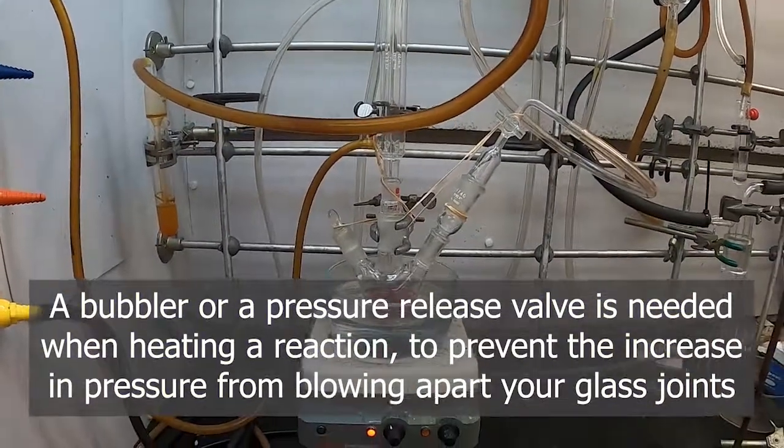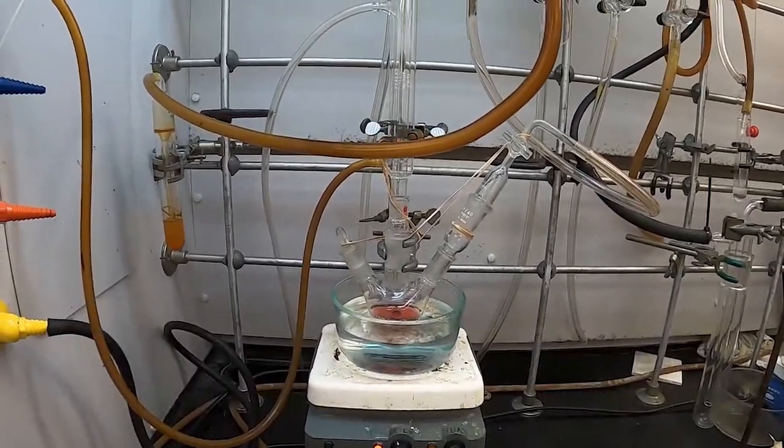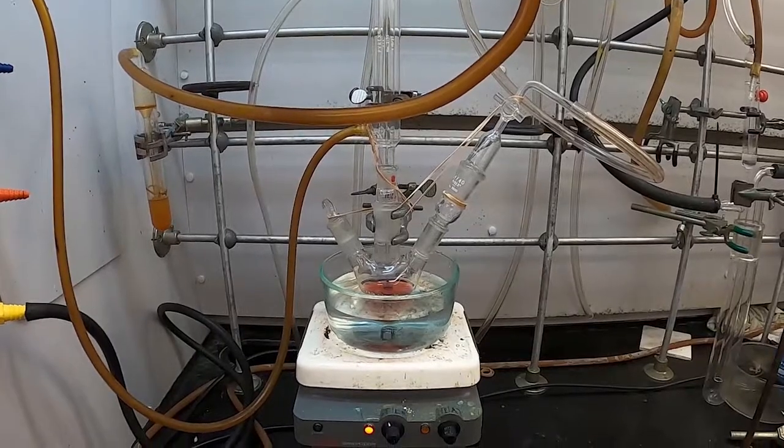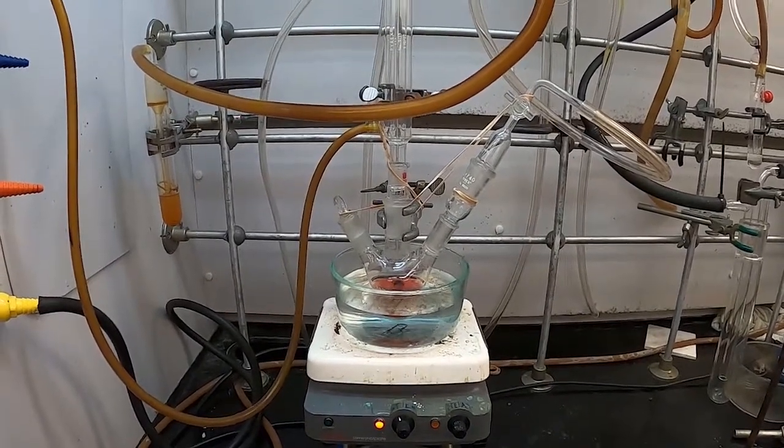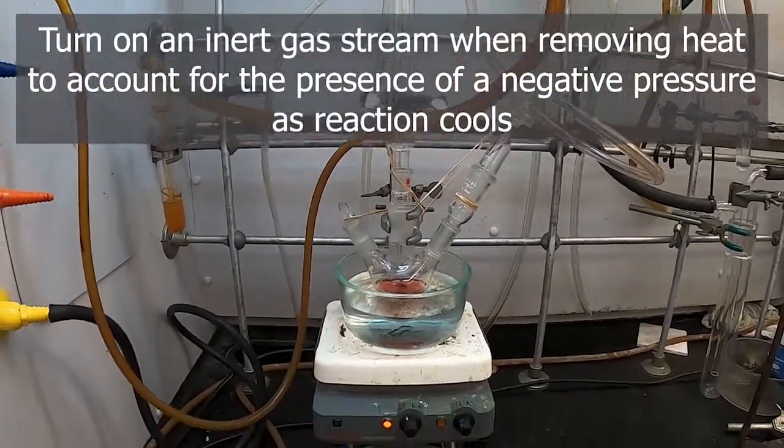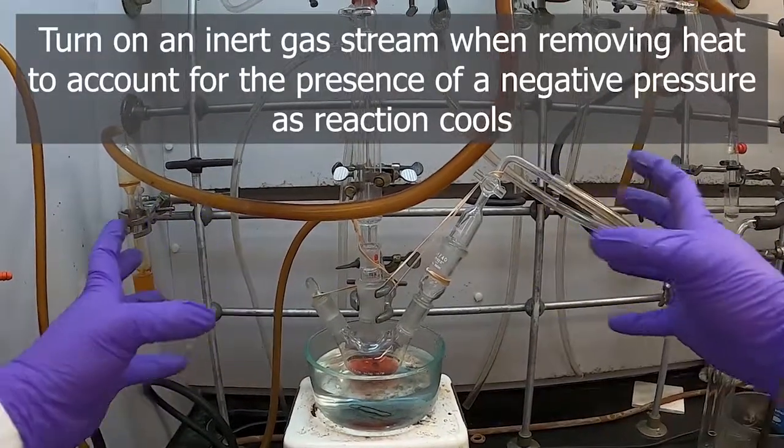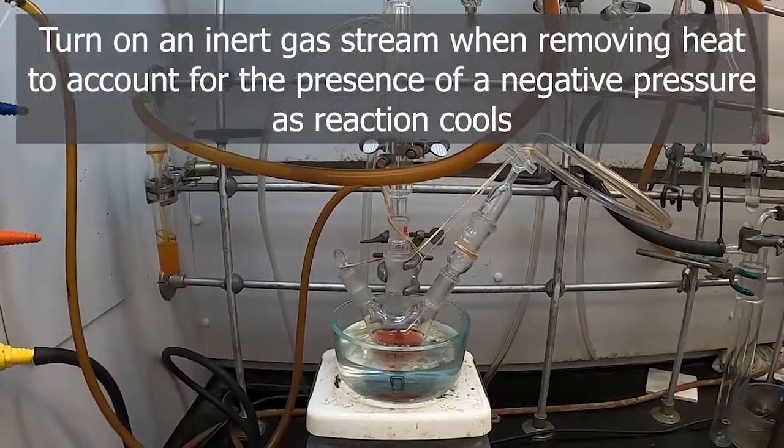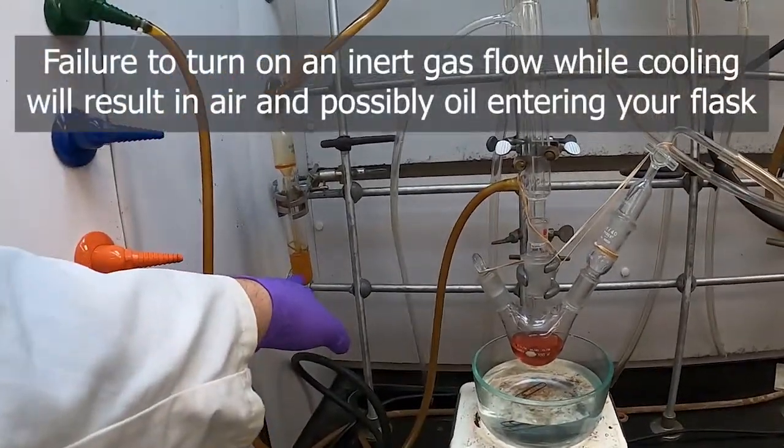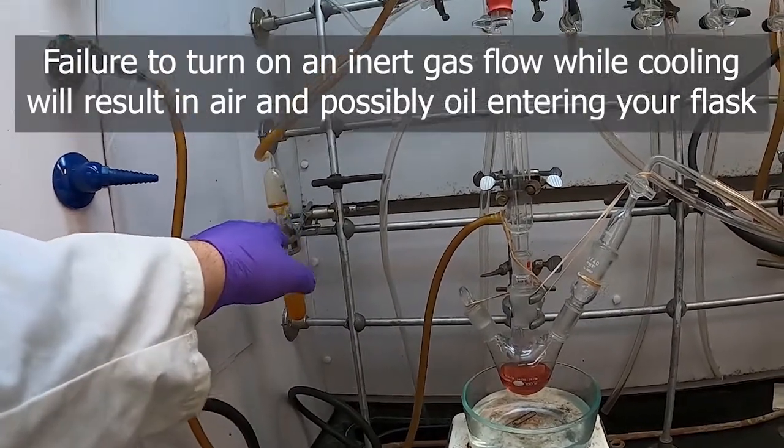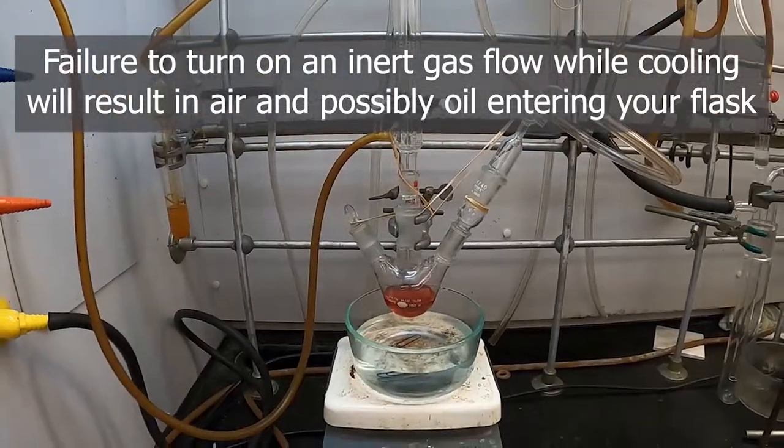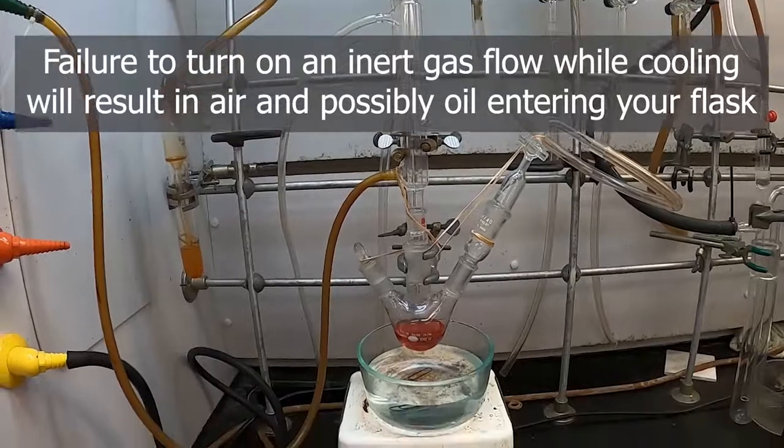We'll also want to make sure that once we lower the heat or remove the heat source and let the apparatus cool, that we engage our nitrogen flow so that as the apparatus cools and it shrinks, it doesn't bring atmosphere in with it and spoil our reaction. If we don't do that, you'll see the bubbler here will draw oil up the tube and begin to kind of pull the oil back up and try to pull it into your reaction if you have your bubbler attached but no inert gas flow as the reaction cools.